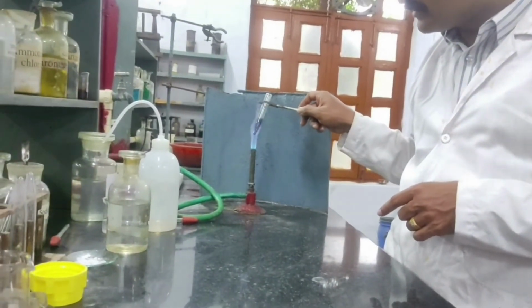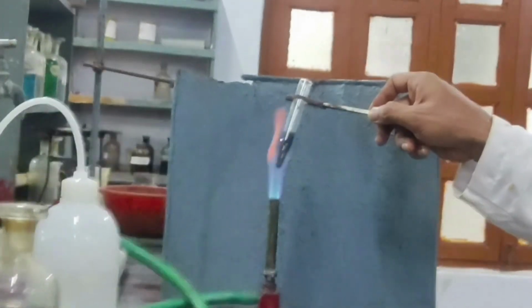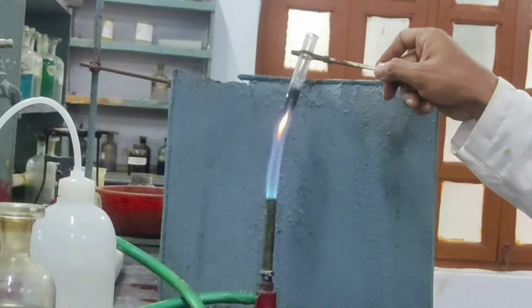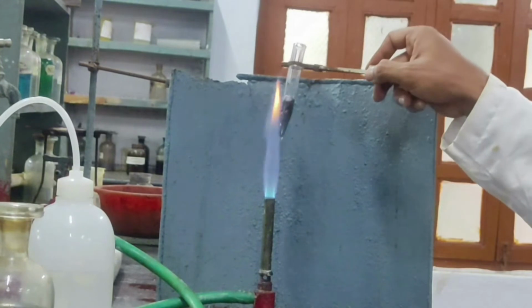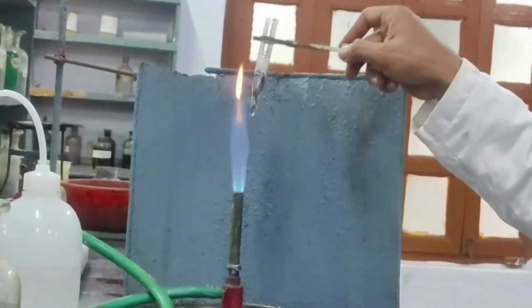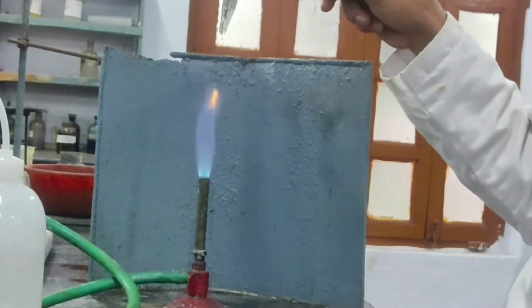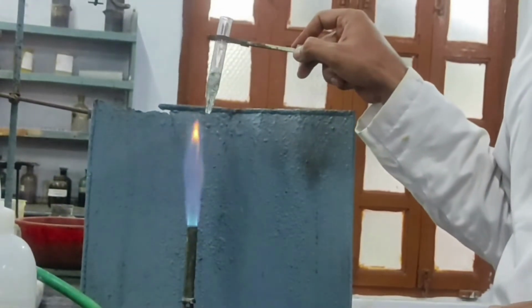So I am heating this centrifugate for expelling H2S gas. I am heating slowly to expel H2S gas. See the bubbles? You can see the escape of H2S gas. You can see even the clear solution that is formed. You see, H2S gas is expelled out.